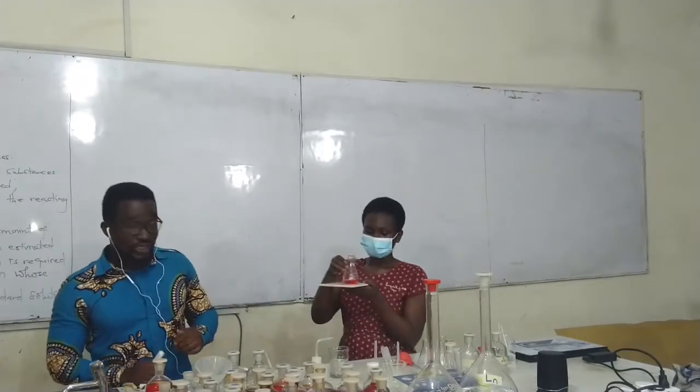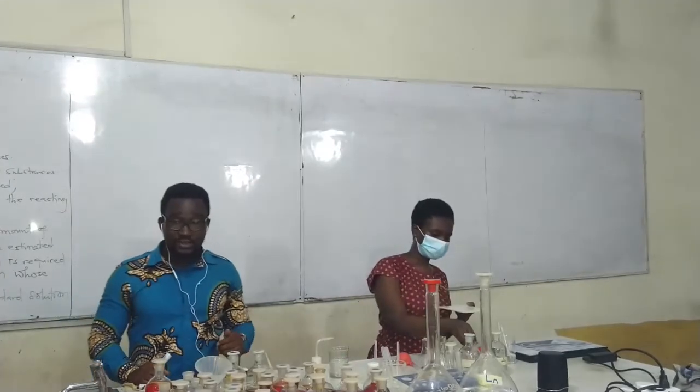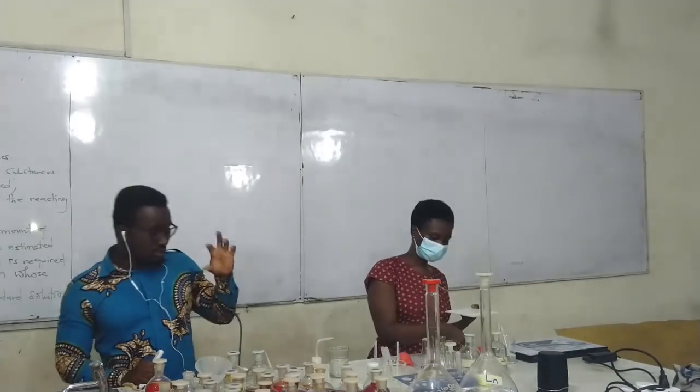Let's make the same solution A and then also find out the nature of phenolphthalein in that solution A.